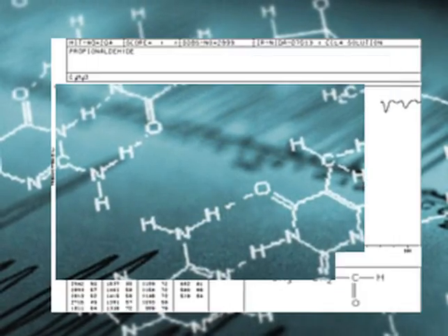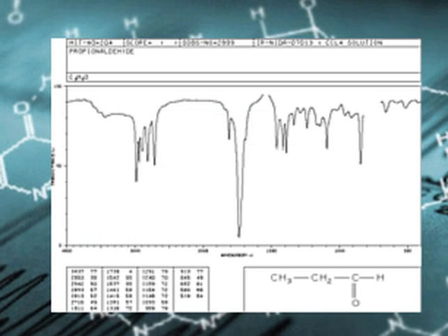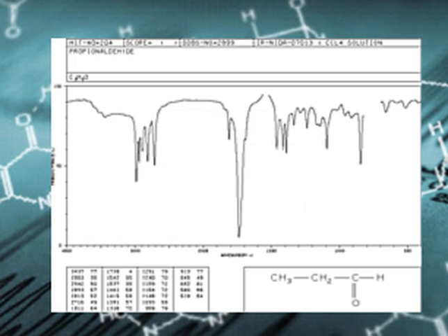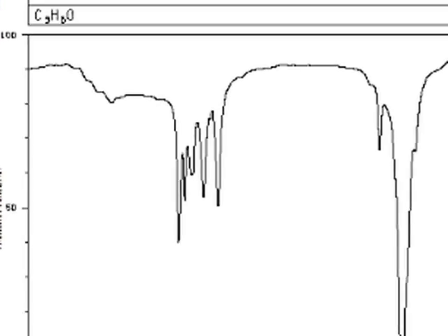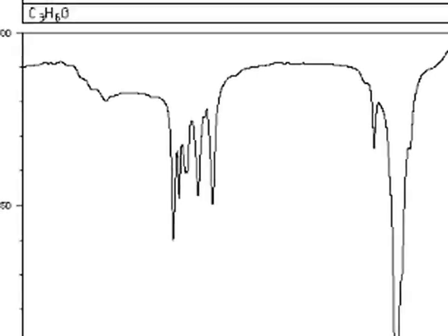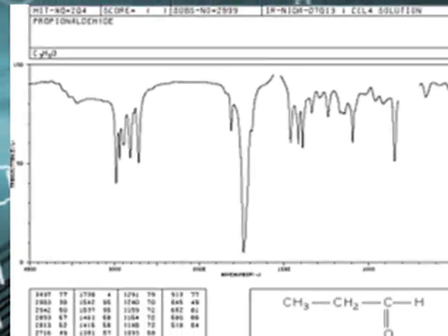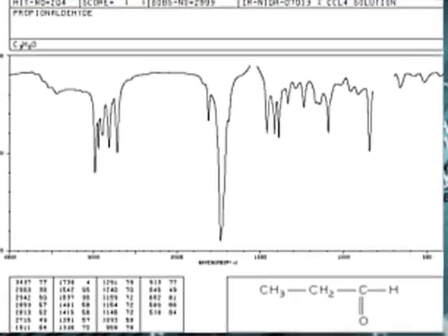Let's assume this is an IR spectrum of our unknown sample. If we look at the IR, we notice peaks. The pattern and location of these peaks allows us to narrow down the variety of functional groups within the molecular structure of our sample.